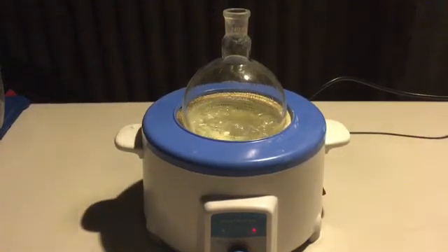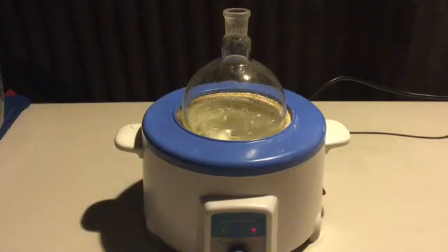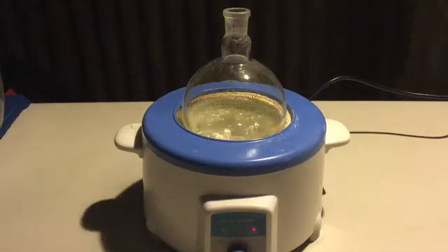Here I also show the fumes evaporating from the flask. An Erlenmeyer flask was placed directly above the boiling flask, which caught some vapour which instantly condensed. This condensed liquid was tested for pH and, unsurprisingly, the pH was very high. Therefore, I advise against inhaling the fumes.